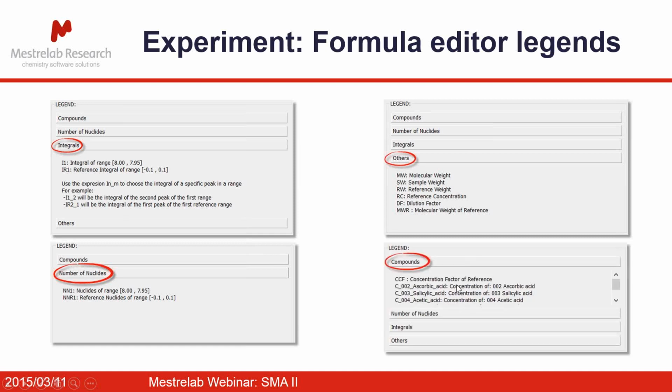And lastly, and this is an important one, you can use data that relate to analyses that have been performed previously in this particular experiment. This sounds a bit weird. So what this is saying is that I've done a number of other determinations, and below that I can access the results of those determinations. Okay, you'll see this in a second, and hopefully it'll be clearer to you.